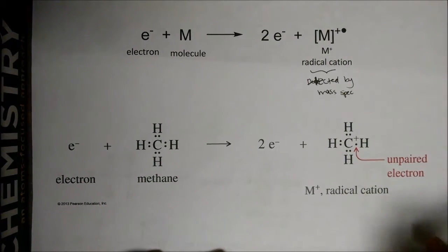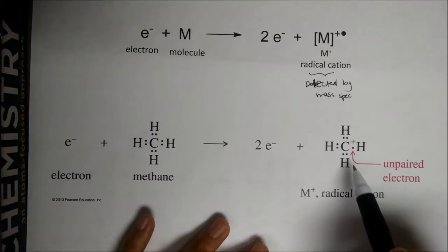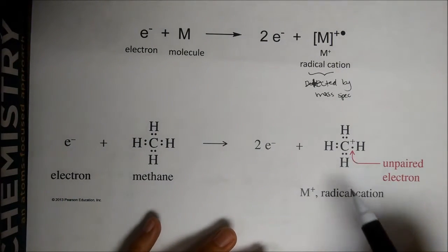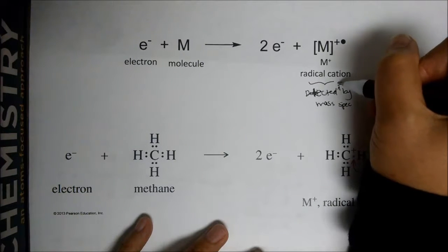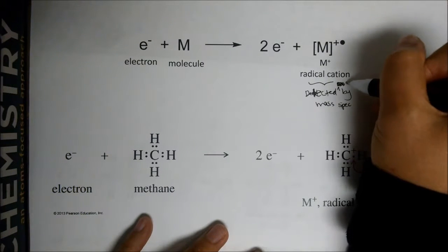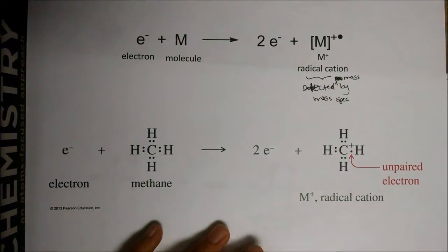So the cool thing is that what we detect by mass spec is its mass. We detect the mass by mass spec.